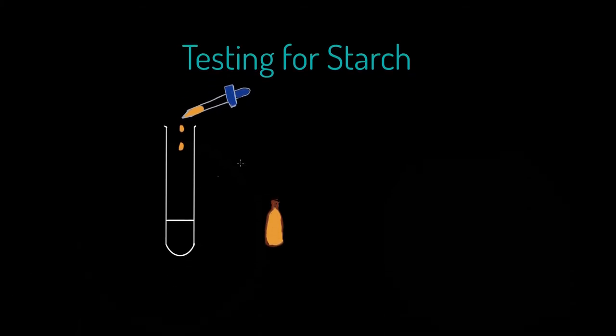Let's have a look at a test for starch. We have here some iodine solution. Iodine solution is the reagent we are going to use to test for the presence of starch. How are we going to go about this? We're going to take our food solution and get two centimeters cubed of that food solution and put it in a test tube. That is going to be consistent for all of our tests.